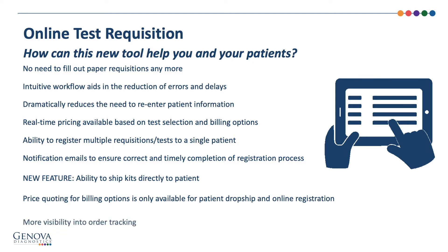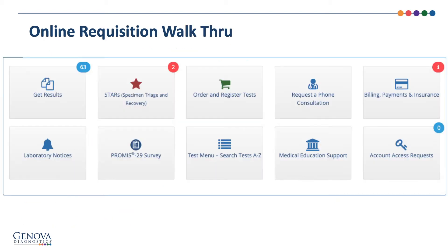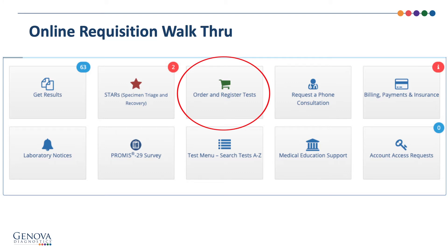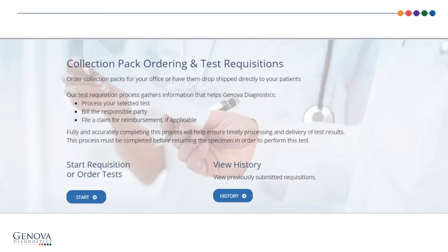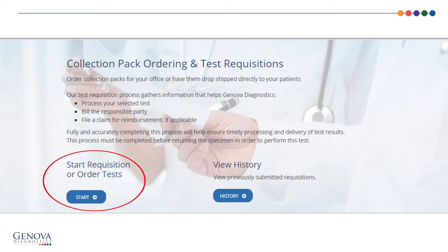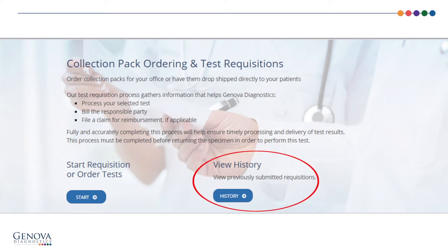More visibility into tracking an order. Let's walk through how this application works. To start, the program is located on your MyGDX dashboard. Once in the application, you can begin the process of registering a requisition for a test, or you can view previously registered tests or partially registered tests via the History button.